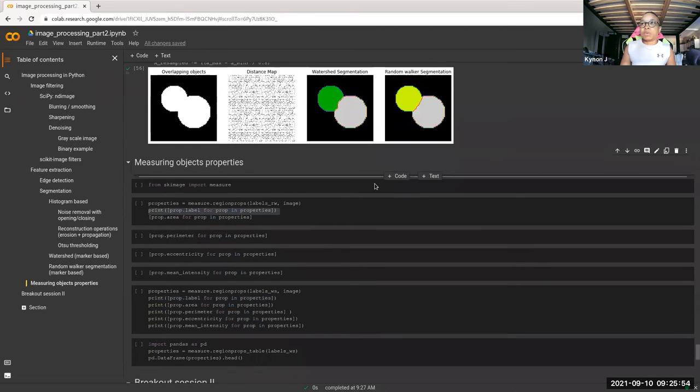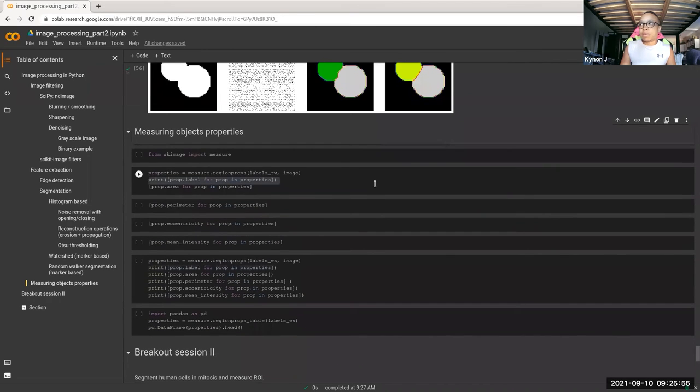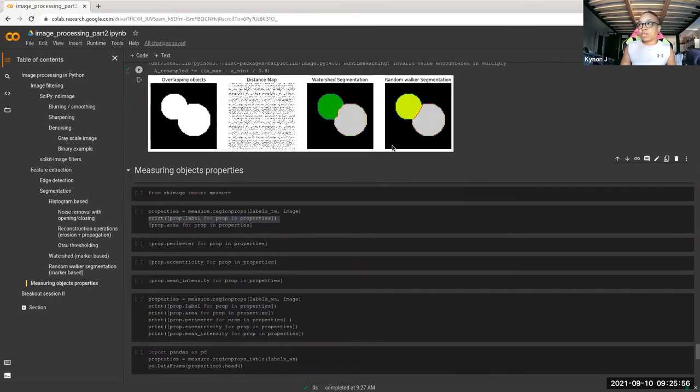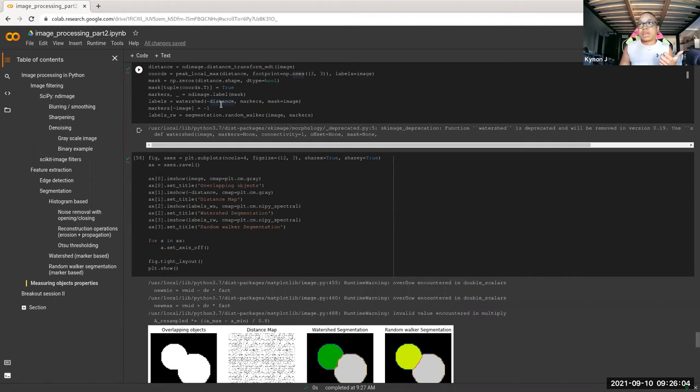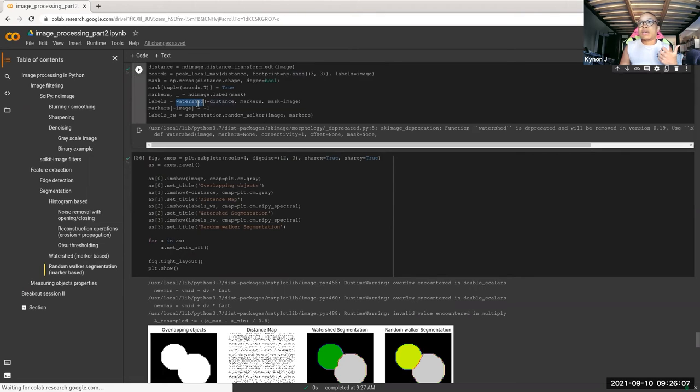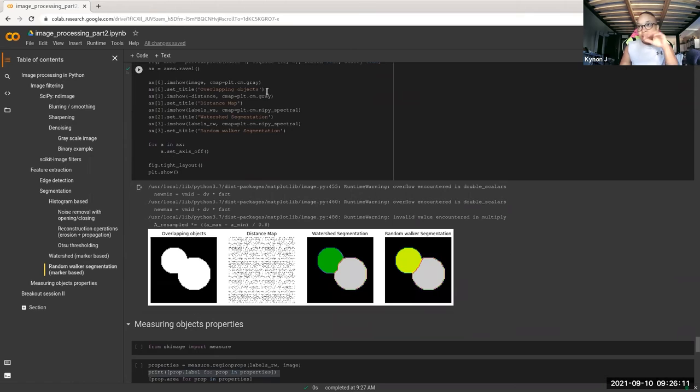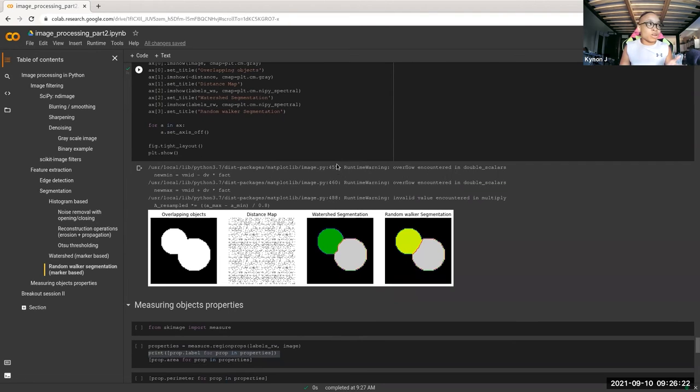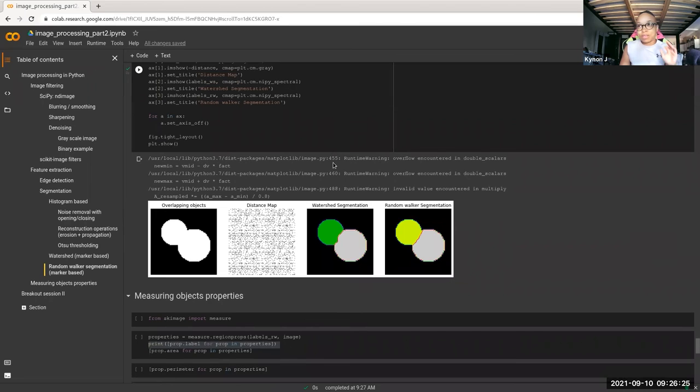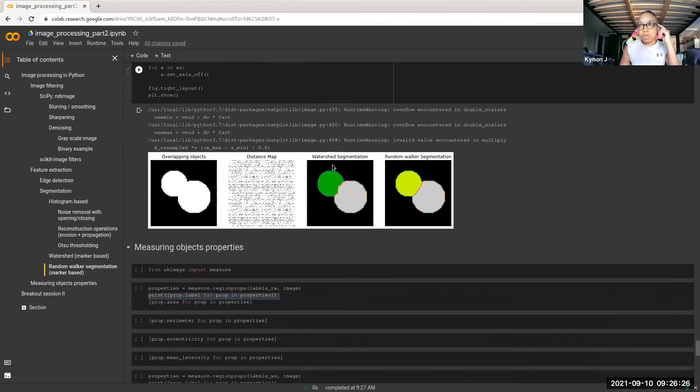That was the main ones for doing segmentation. If anybody's familiar with doing this stuff in ImageJ, it's very similar. You're just doing the algorithms by hand, calculating your own distance matrix and then applying the function. And it's always good to visualize because you want to make sure that they're applying the correct mask. Otherwise, I mean, what are you measuring? You want to be making sure you're measuring the right thing. That's always where human eyes are important.